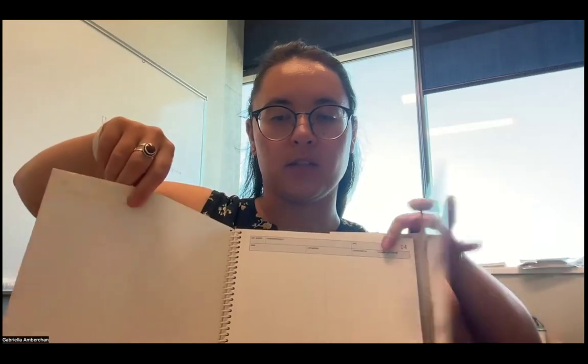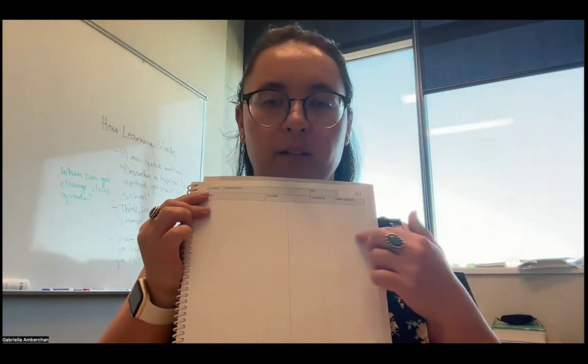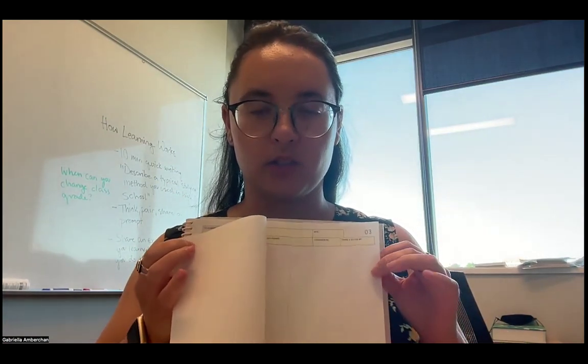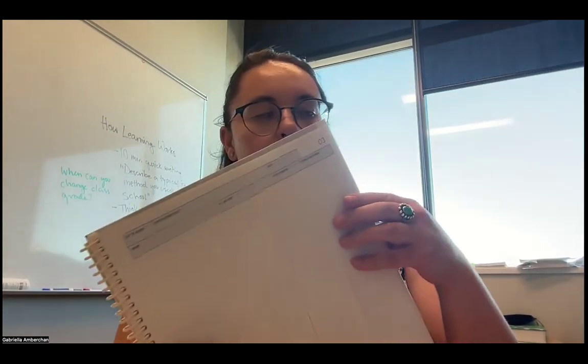So what you will want to do is take these two pages, the normal page and the carbon page, flip it over, slide the blotter underneath, original page is on top, right. Okay, your ink will transfer onto the carbon copy. This is what you will turn in to your instructor, and it will not bleed onto the next pages. So that's the purpose of the blotter. All right. If you have any questions, please reach out.